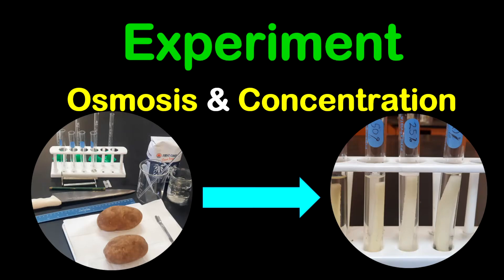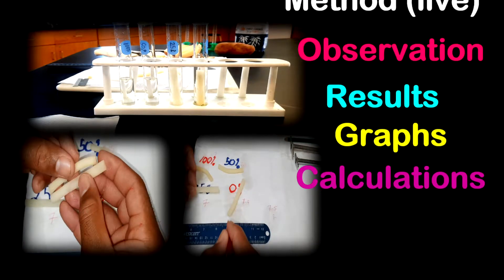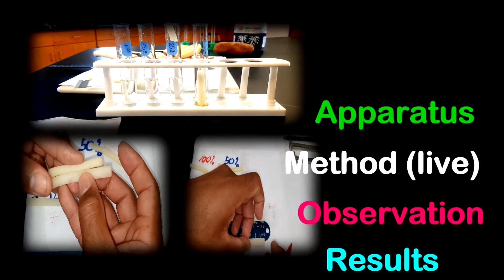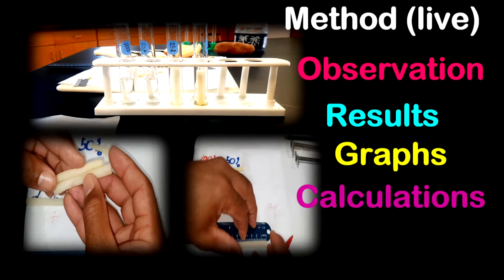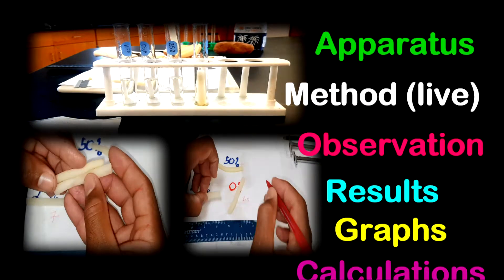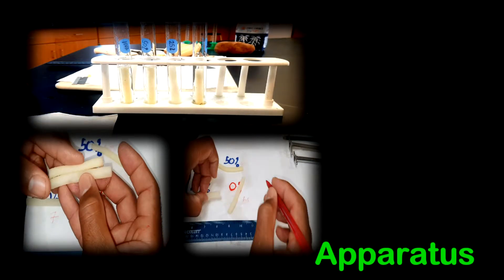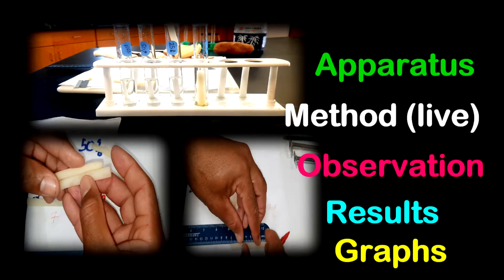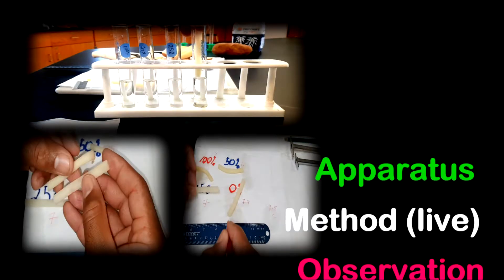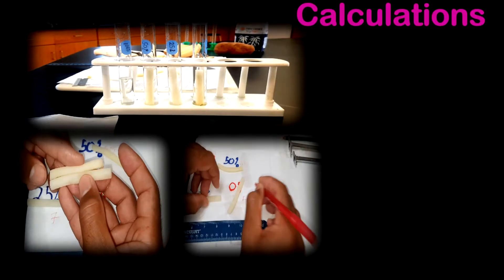Hello everyone. Today I'm feeling really happy and excited and I truly hope you're feeling the same way too. Today I'm going to demonstrate an experiment testing the effect of different sugar concentrations on potato tissue — this experiment is about osmosis. I'm going to walk you through the apparatus needed, demonstrate live methods, show real footage of what I did, observations, results, possible graphs, and useful calculations needed for this experiment.